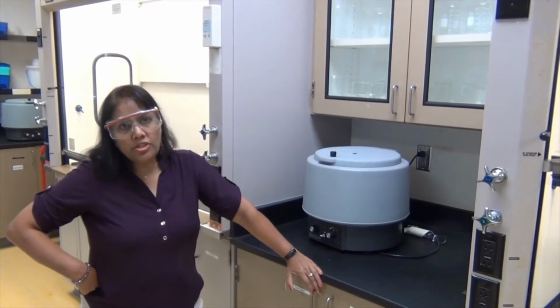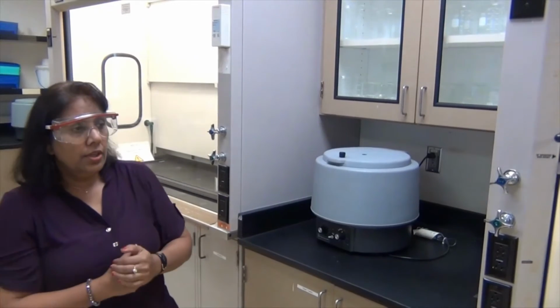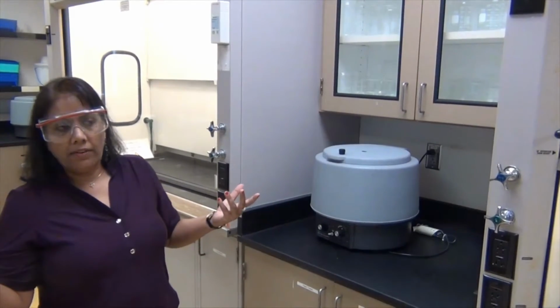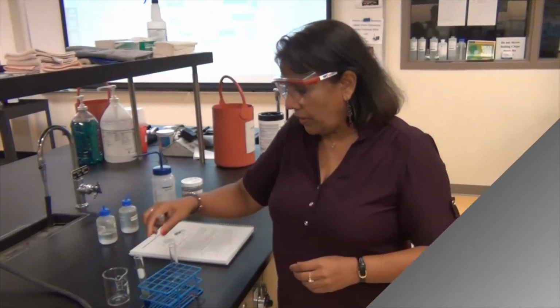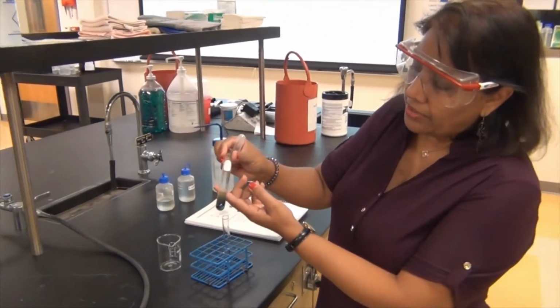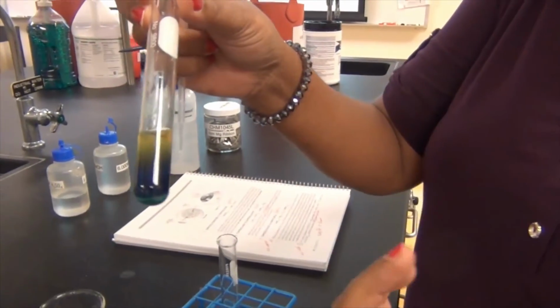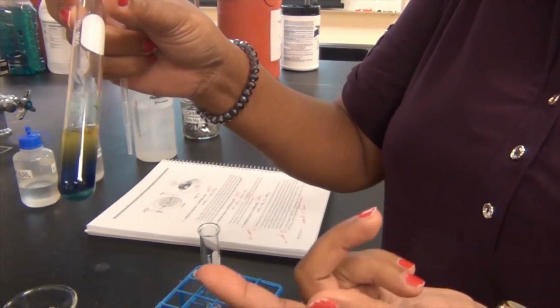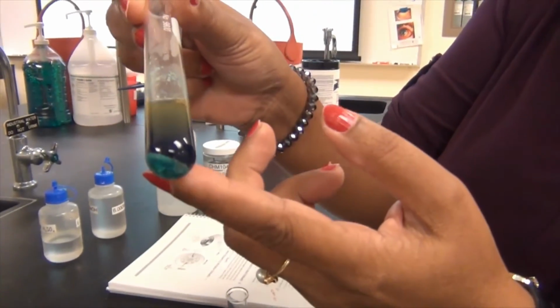What the centrifuge does is it separates the solids from the liquids, so that's what we want to do. I think I gave the game away, right? So there's a solid in there. Okay, so now we've had the centrifuge done, and you can see what it looks like. Now, because I didn't use the ice bath, and I'm not doing this twice, because technically you're supposed to add water to this and do it twice, you can see that there is something at the bottom over here, okay?